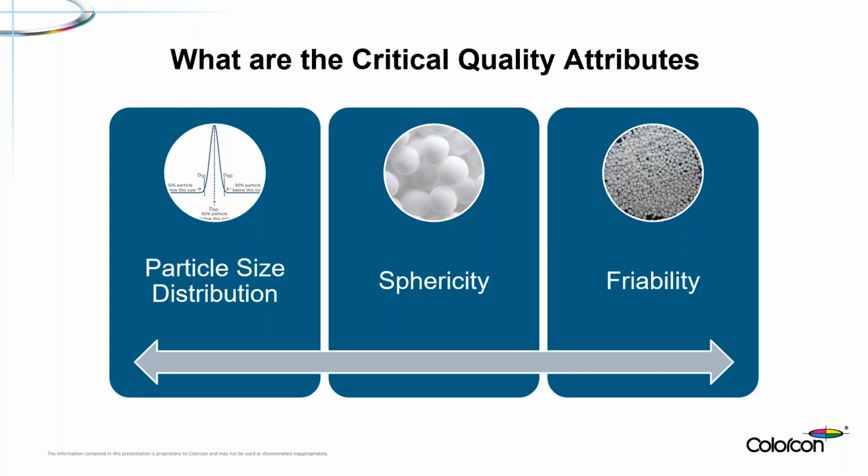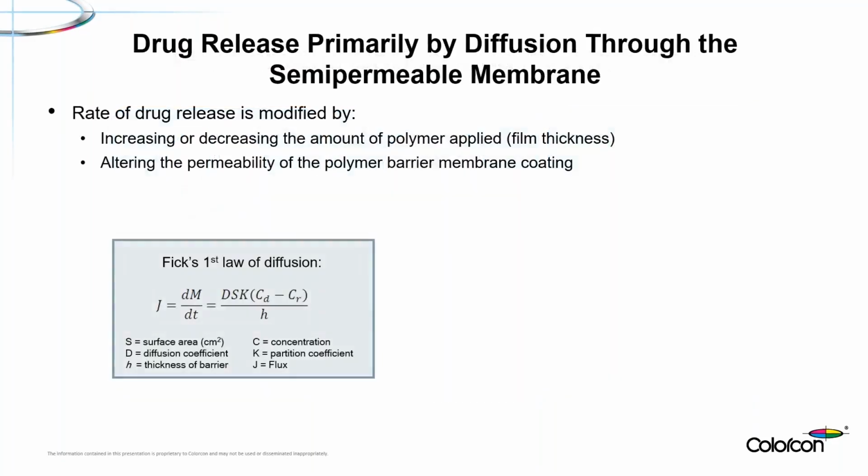So the take home here, and our best practice approach, would suggest working with a supplier who understands and controls these quality attributes as part of, per se, a specification, and designing a fluid bed coating process that avoids attrition and friability during processing. To better understand formulation performance, we need to understand what controls drug release from a multiparticulate.